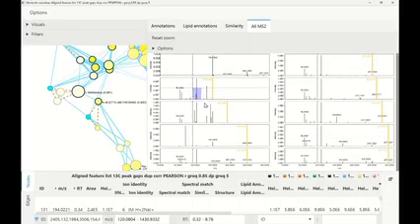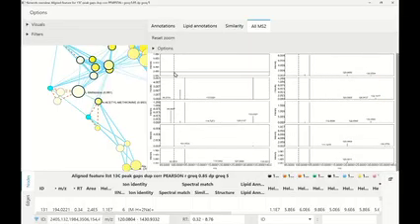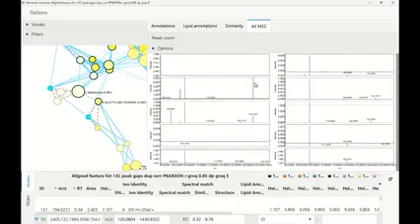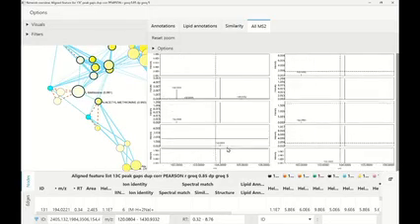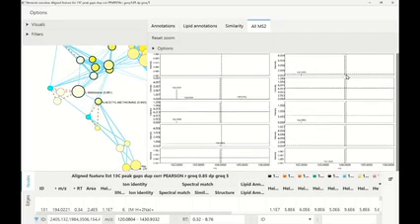So now we can see if there are some fragment signals that are always present in this network, in this cluster. Very often, because we use cosine similarity for matching, this is the case. Here's one signal that is present in most of the spectra, and only in one it's a little bit tiny, but the rest really have the same signal.